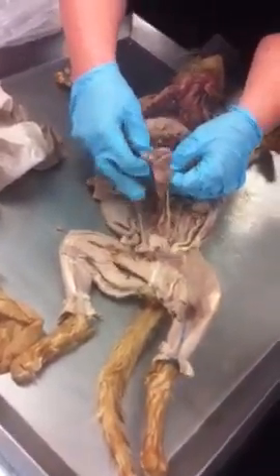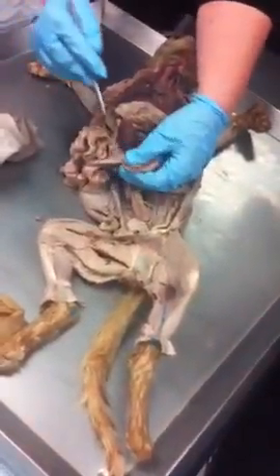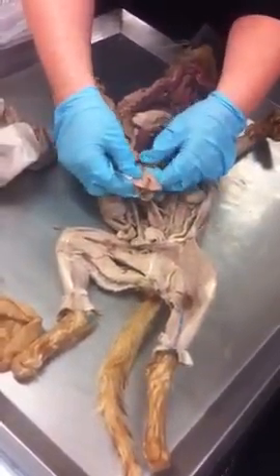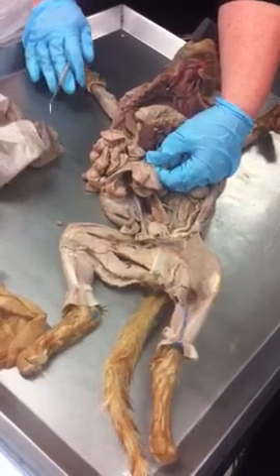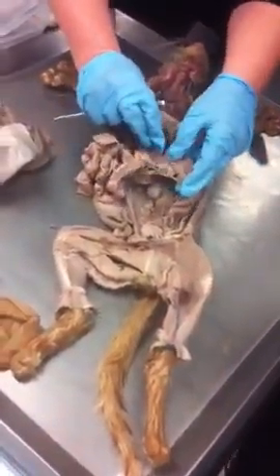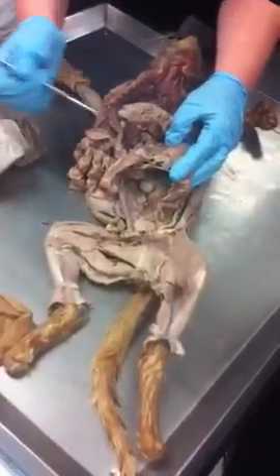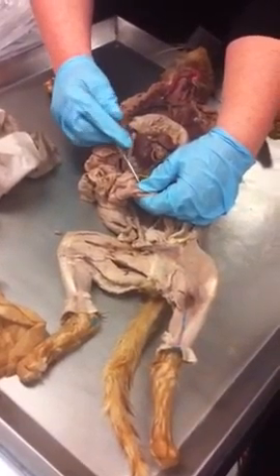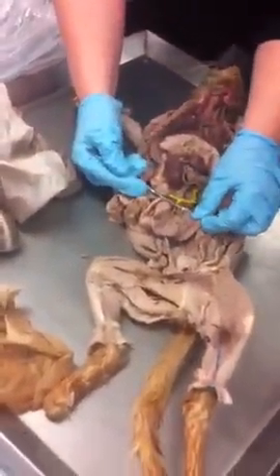So we decided last week to use a landmark, and there's our landmark. What's the landmark? The ileocecal valve. And so the artery going straight to it is going to be your ileocolic. And then if you look at the colon itself, and maybe halfway along the length or so, not in the mid-region, the artery going to that is going to be your middle colic.